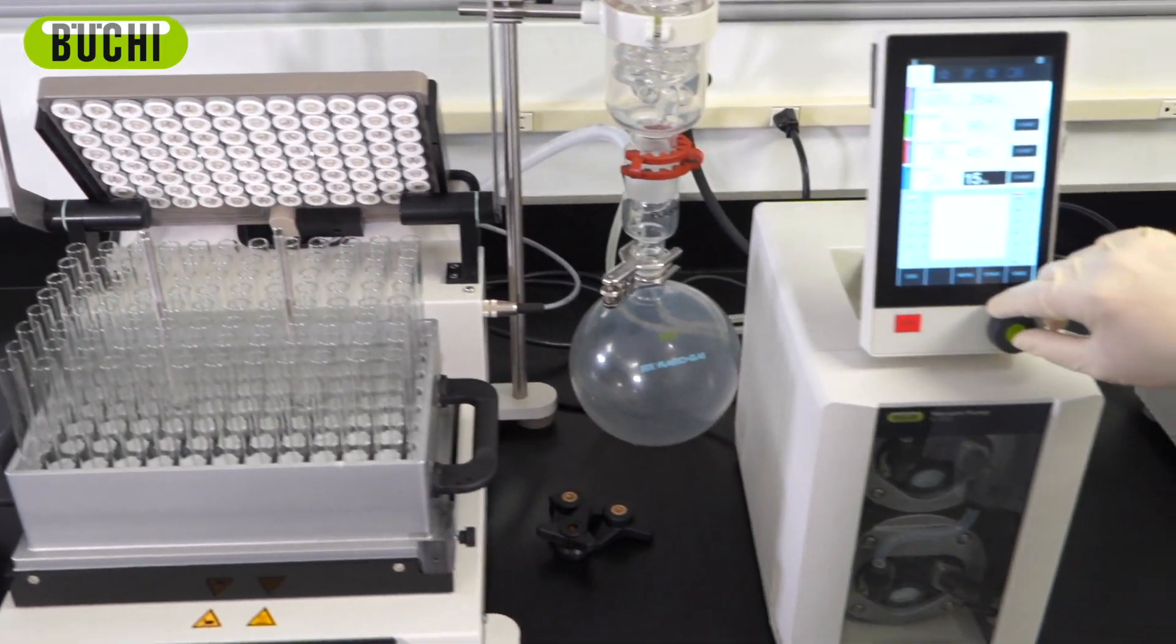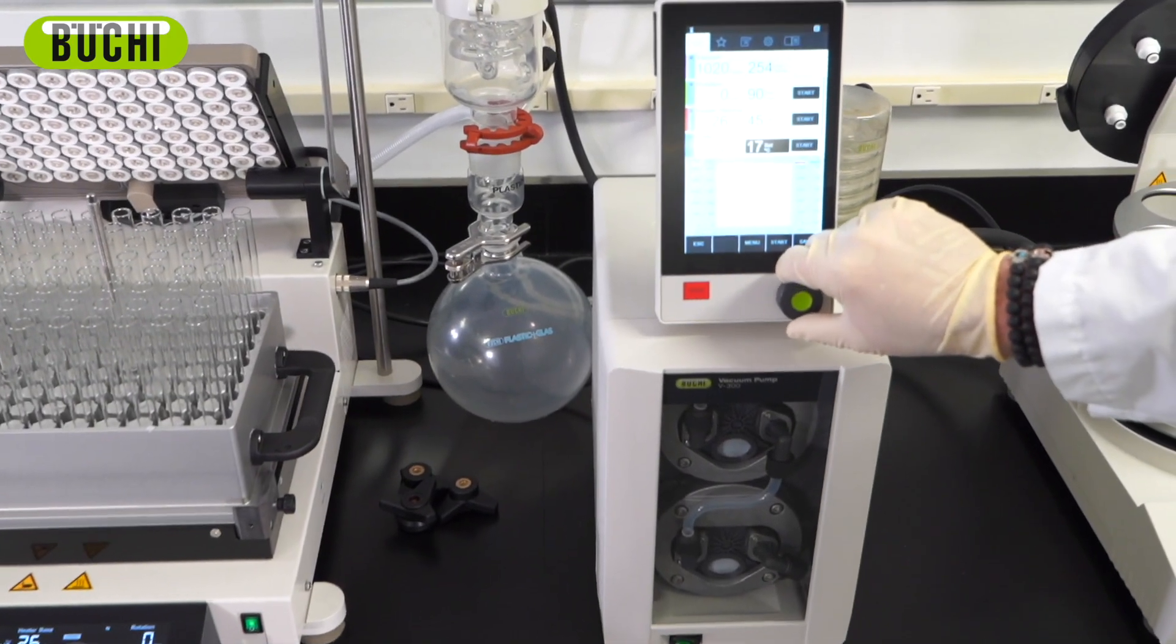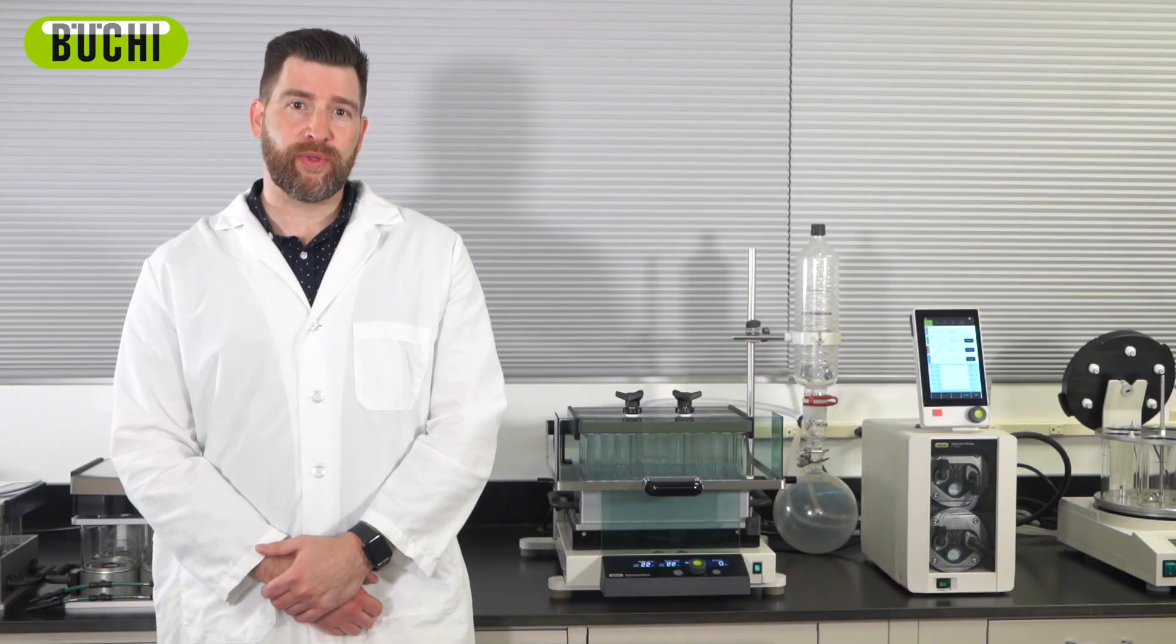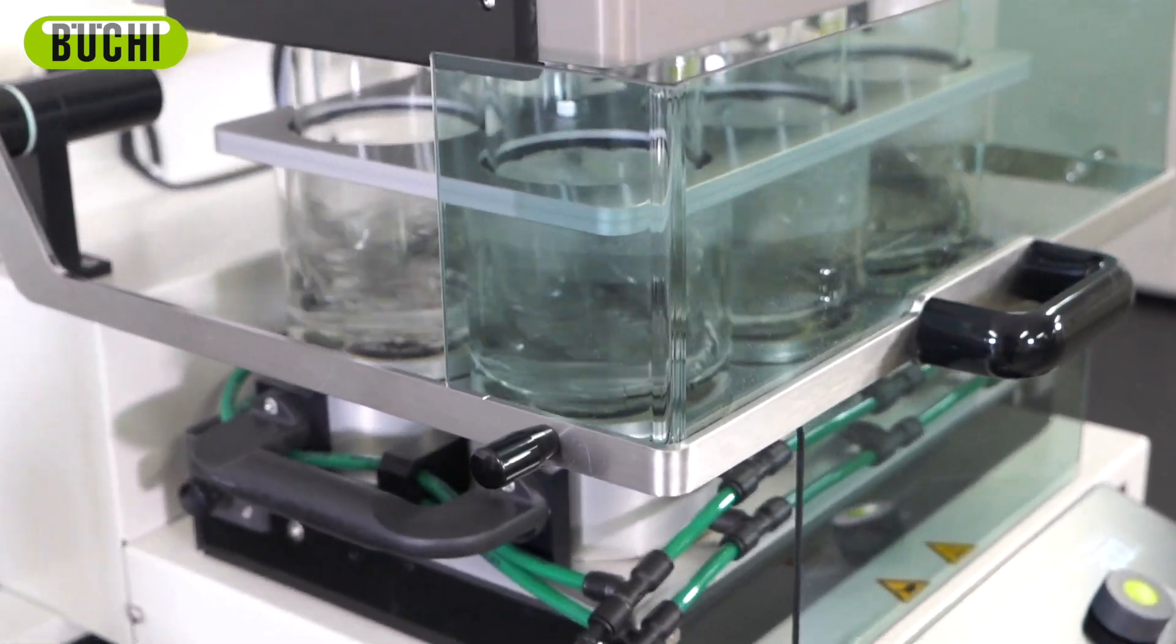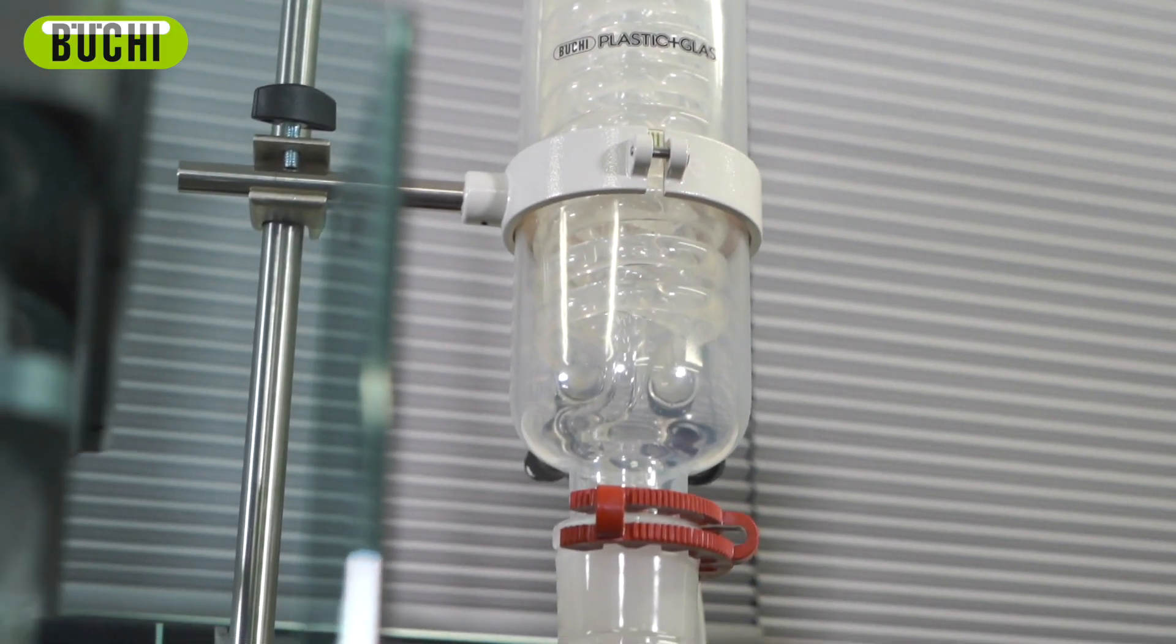The Syncor Plus, when paired with the i300 Pro, is fully automated and easy to use, allowing you to proceed with other tasks while the program monitors your precious samples. Process automation ensures the highest analytical precision, reproducibility, and meets strict safety standards.